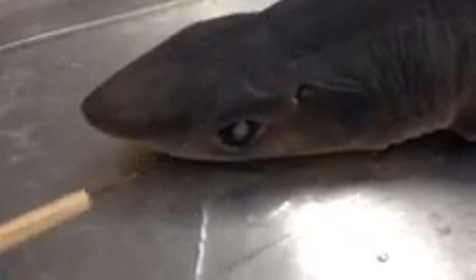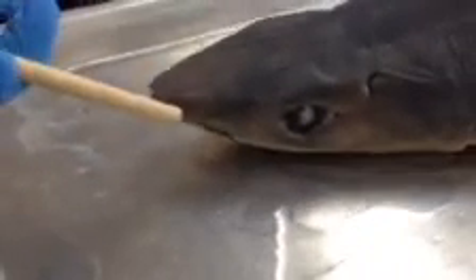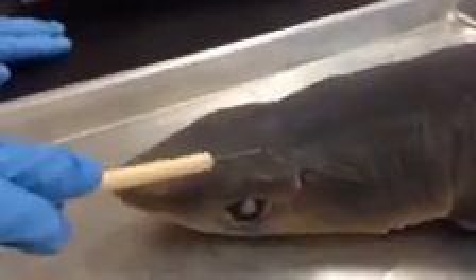These are the eyes. And then underneath here is going to be the mouth. And then these little openings here are the spiracles.